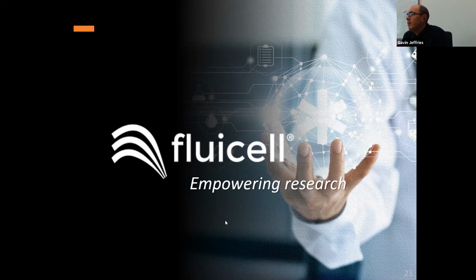So I think that in the future, that direction of minimizing animal usage, it's always going to be there, but bioprinting in general has a focus on minimizing the use of animals and actually using more human-specific tissue models.